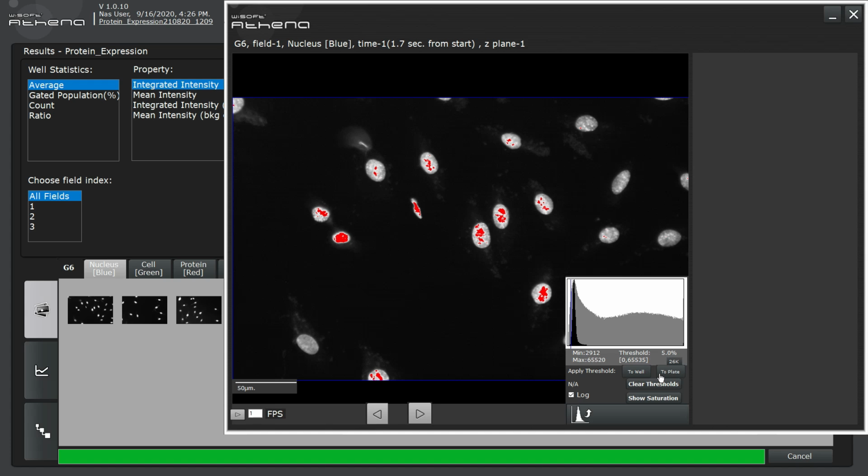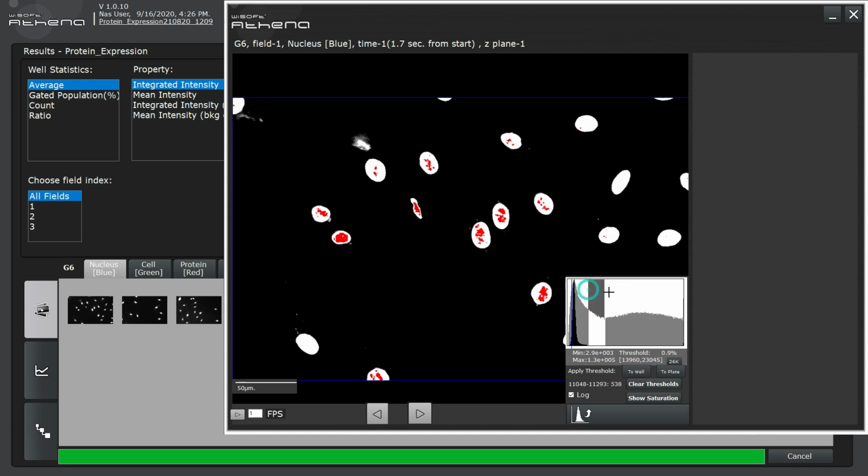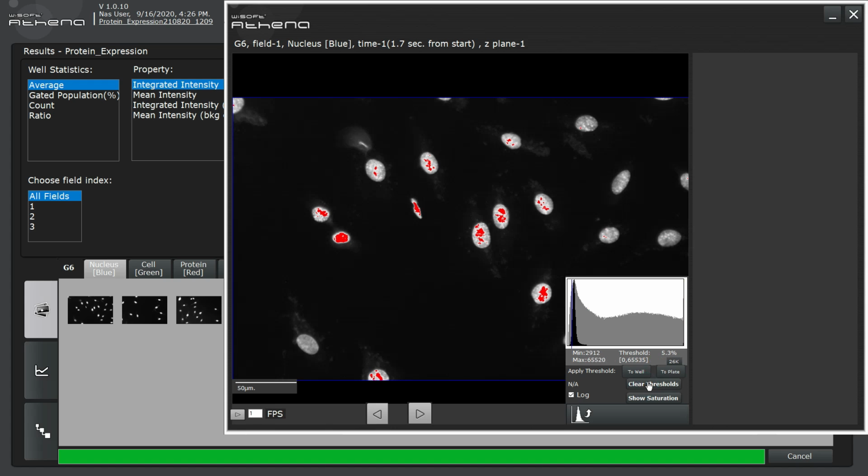Setting a constant contrast range is necessary if we want to visually and qualitatively compare fluorescence intensity across a plate. Setting the contrast range in each color channel is also needed to obtain high contrast overlay images, since the black and white levels set through the pixel intensity histogram are also used when creating RGB color overlay images. I will now demonstrate how this works.